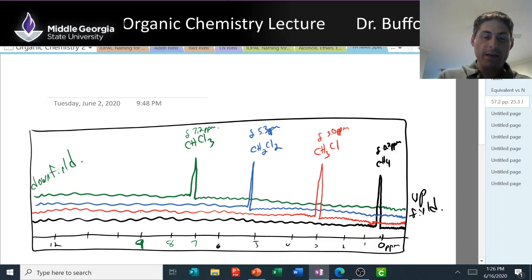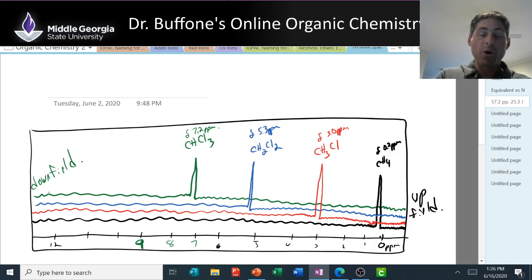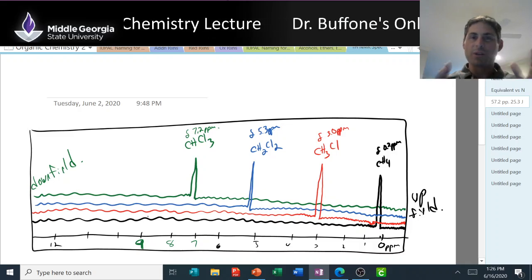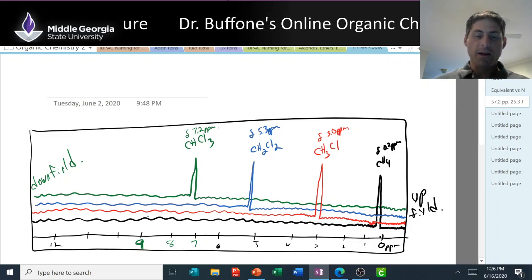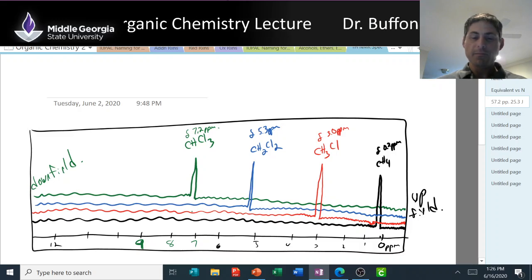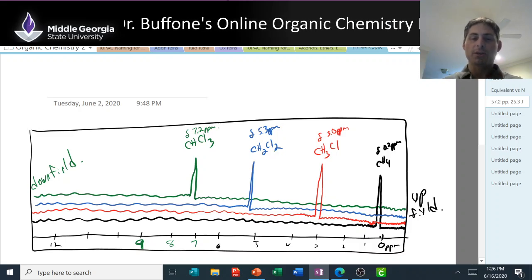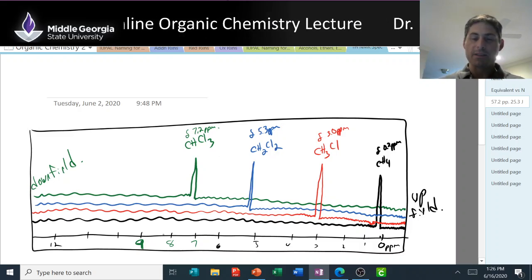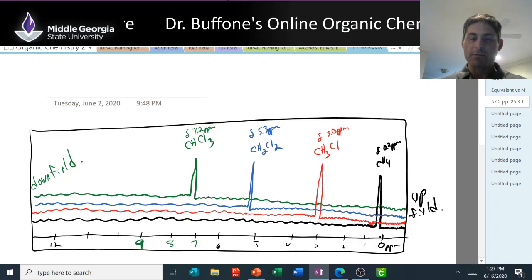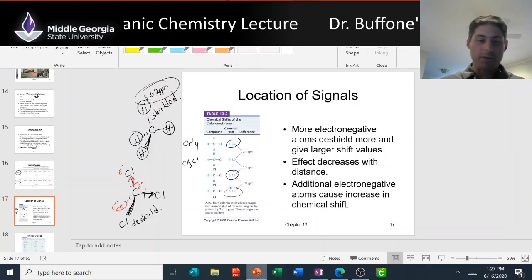You do see aldehydes. The proton on a carbonyl of an aldehyde is down near 9. The proton on the oxygen of a carboxylic acid is at 12. Those are the only 2 that we really see way downfield. Aromatic rings tend to give you signals at 7. Protons on carbons that have multiple electronegative groups are downfield at 5 and 7. Also, protons on carbon-carbon double bonds are downfield at around 5 or so. And we'll talk about all these different types of groups in just one moment.